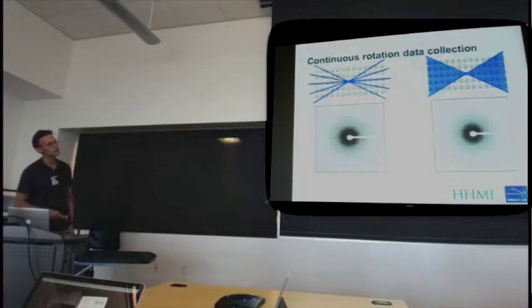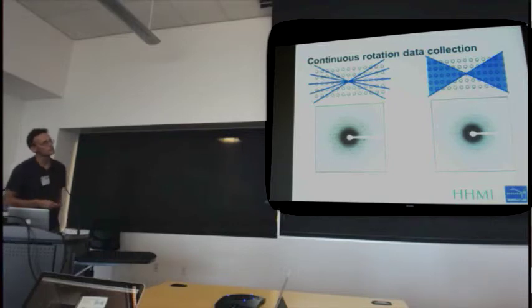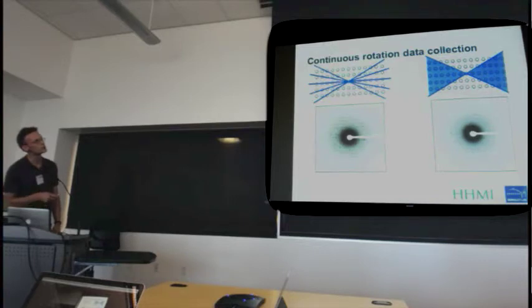So further refinement of that technique. I mentioned that, due to the low dose, we can collect more than one image of the same crystal. Shown here, we're sampling 7 different times.